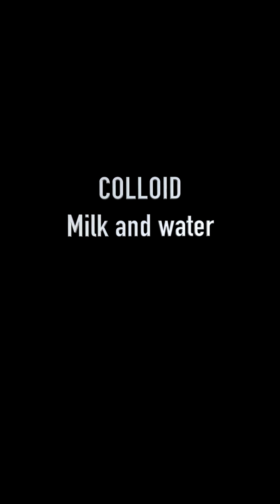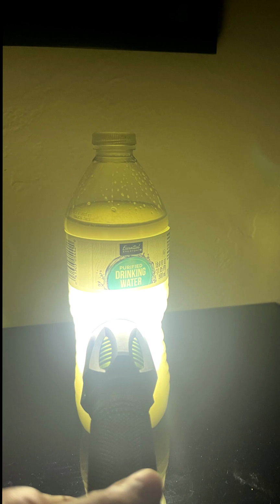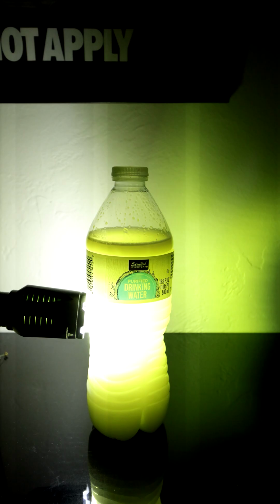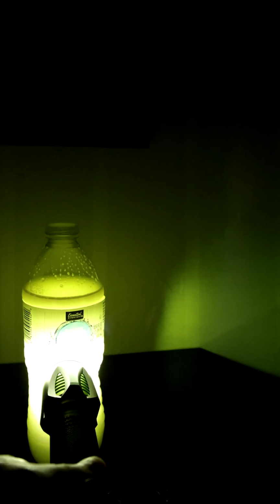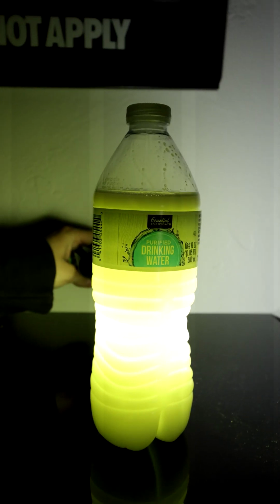For the colloid, I used milk and water. This is a heterogeneous mixture. The Tyndall effect is the scattering of light by particles in a colloid or a very fine suspension, and it makes the path of a light beam visible when it passes through something like fog, smoke, or any type of colloidal solution.